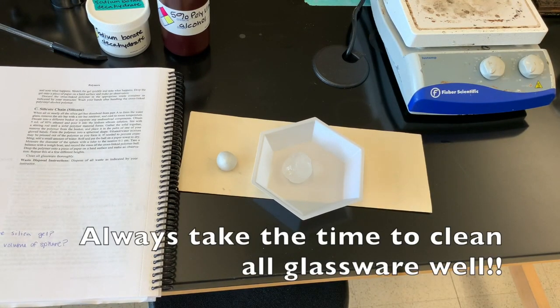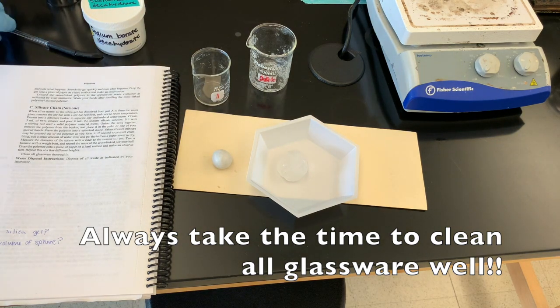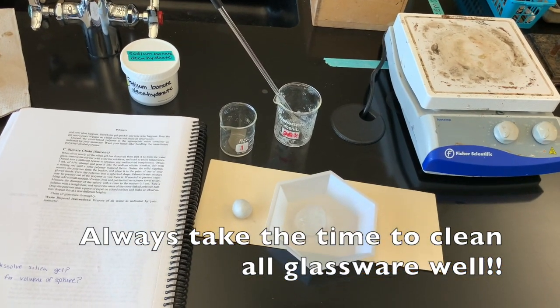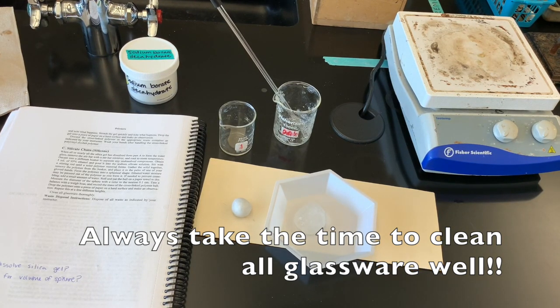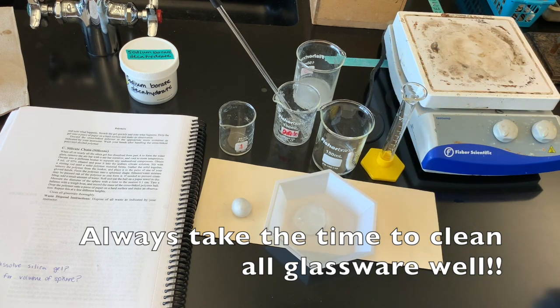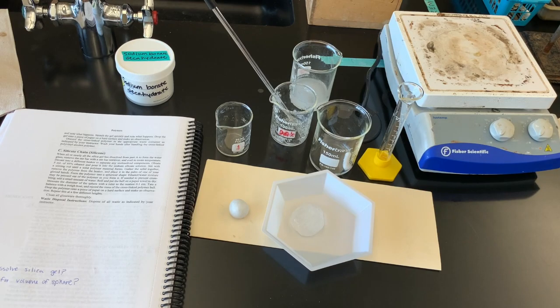Something to note about this lab is that it is very important that you clean all your glassware very well. You should be able to see a lot of this glassware has residue in it. Make sure you take the time to clean it — put soap in it, brush it out, and clean it until it is actually clean before you leave it on a drying rack. Also wipe down the tabletop because there's a little bit of spillage. I'm also going to put our polymers into a waste container — they're not going to go into the trash.